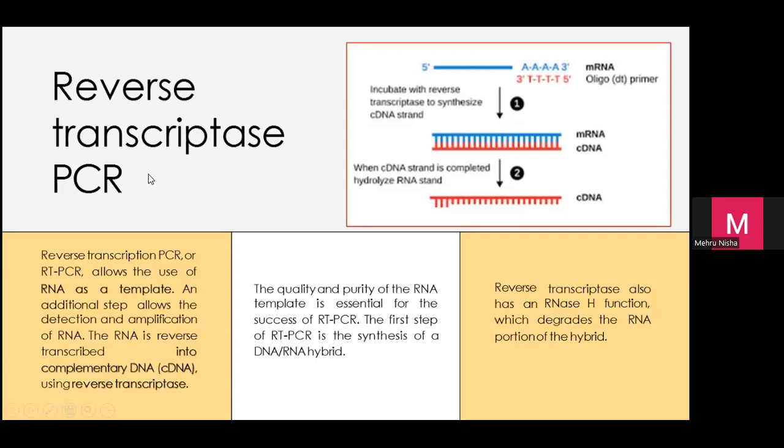Tapi ada setengah kemungkinan apa yang kita extract ialah RNA, bukan DNA. Why kita ambil RNA? Sebab berbanding dengan DNA dan RNA, RNA dia bersih sikit. Dia tak ada macam intron. DNA ni ada intron. Intron bermaksud intervening sequence. Sequence yang suka kacau lah in between the DNA. Kan DNA ni panjang, so macam adalah macam sampah di sini, dia jumping lah. Tapi RNA dia bersih.